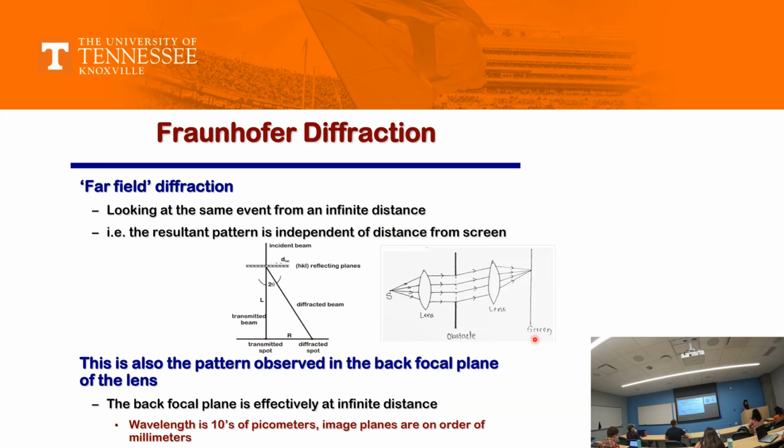Are you talking about the top of the column or the bottom? It's a far distance, right? And at a far distance, whenever you talk about diffraction, you're talking in terms of your sample. This is your sample, which is your obstacle. And these are the atoms here. They diffract it and produce a spot.